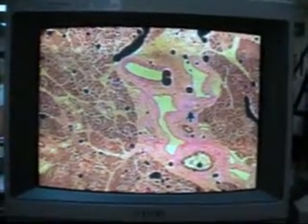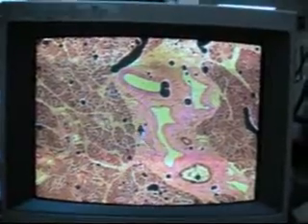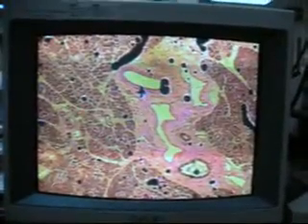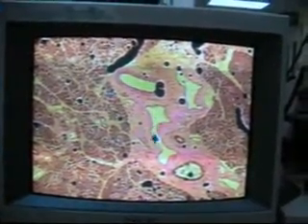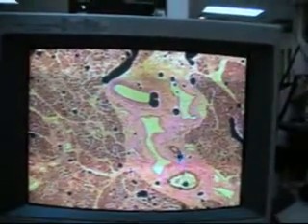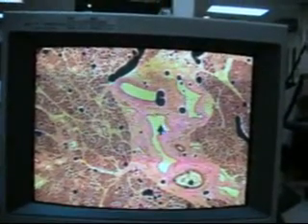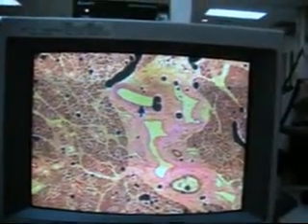So just looking at this right now, just at this magnification, you can almost begin to see, okay, this is going to be a small artery here, this is going to be a small vein here, and this is going to be a duct right there, okay? And so this is going to be a small vein right here, this is a vein right here, and then this is an artery, all right, a small artery.